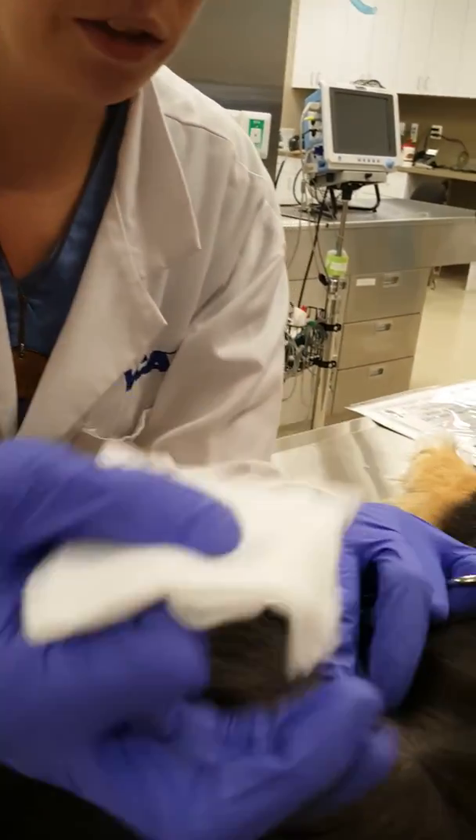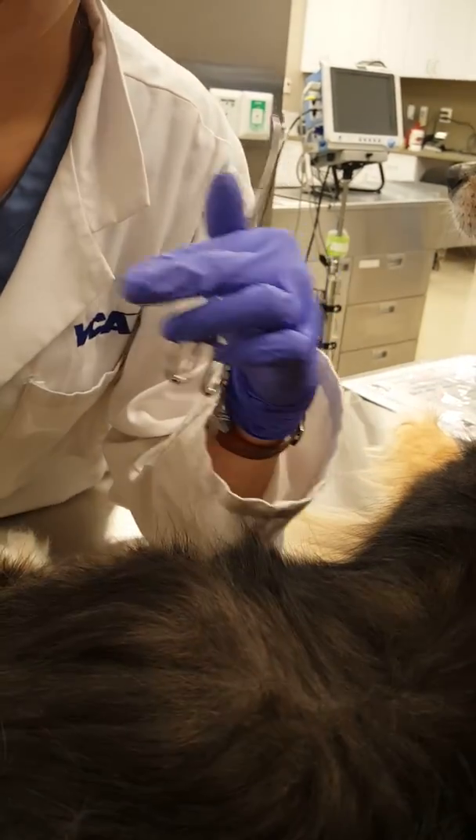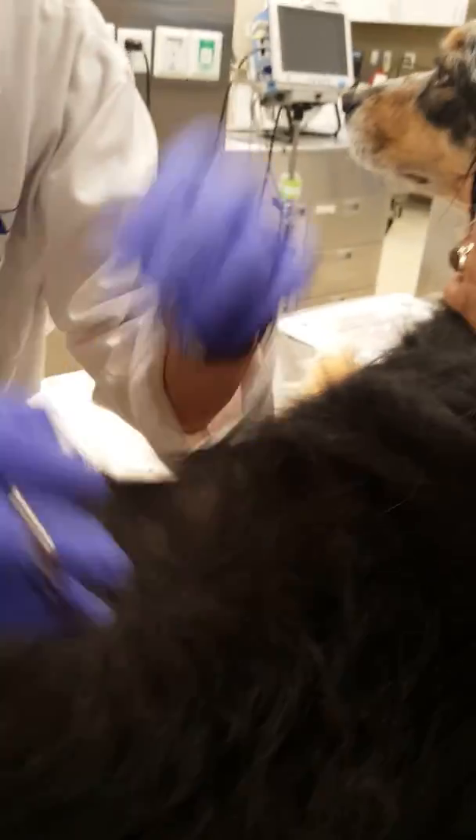So first we're just going to gently pat the area with our alcohol swab, and then we're just going to pluck a couple hairs.